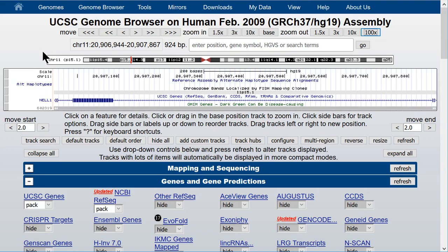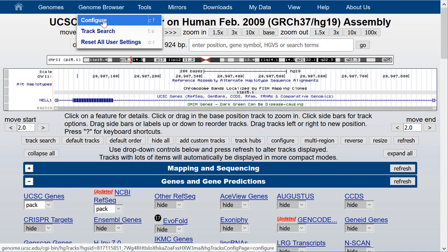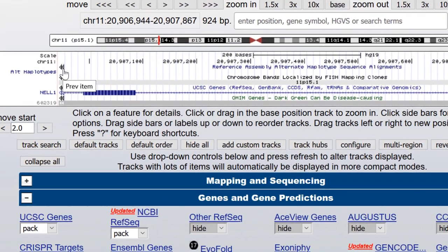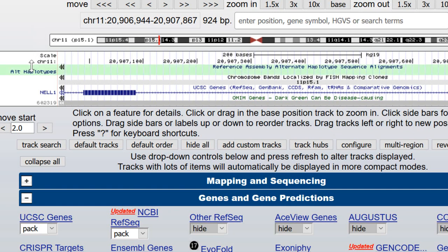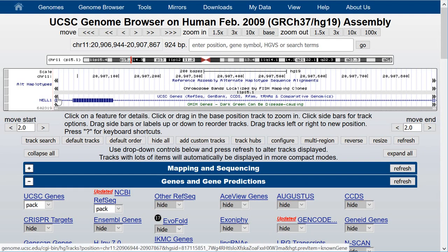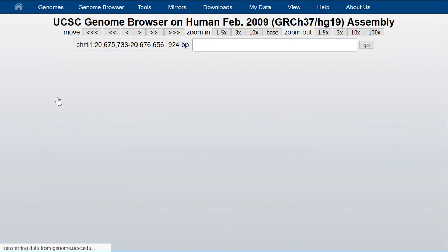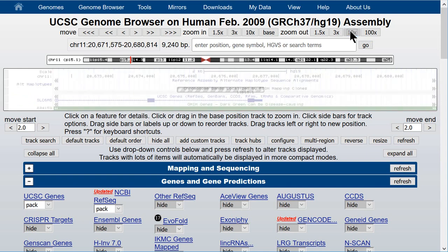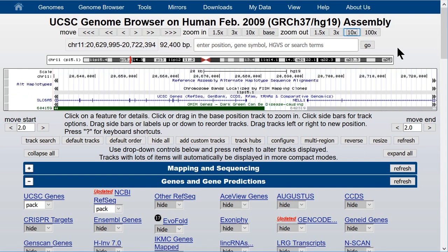There's another configuration option that helps you get around in the browser. If you click on configure, you see the unchecked box for 'next/previous item navigation.' Clicking on that and submitting gives you gray double-headed arrows — each track has one at the very top of the data, at the same horizontal location as the long label for the track. Clicking the double-headed arrow for the UCSC Genes track will go to the next gene in the window, SLC6A5. Zooming out by a factor of 10 twice confirms the NELL1 gene, which we were on before.